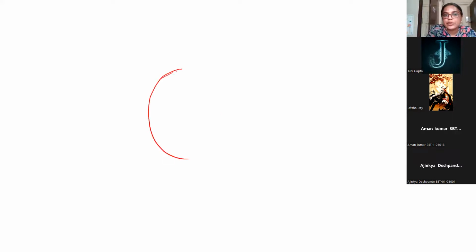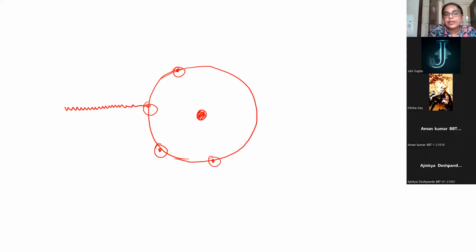I'm going to atoms because everything is matter. Even if I have an amino acid solution, that is also matter, right? Now if I have these electrons in the outermost shell, and this is your nucleus, and a light wave of a particular frequency comes and hits this, what is going to happen? Light is a form of energy.